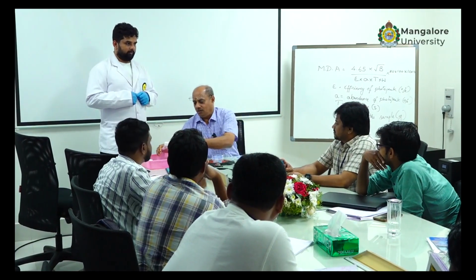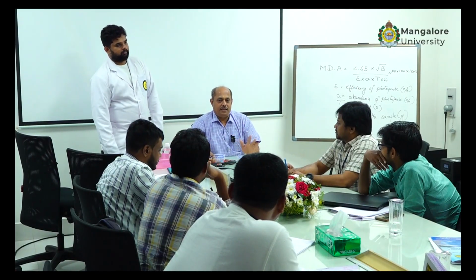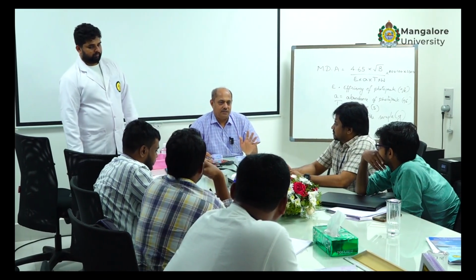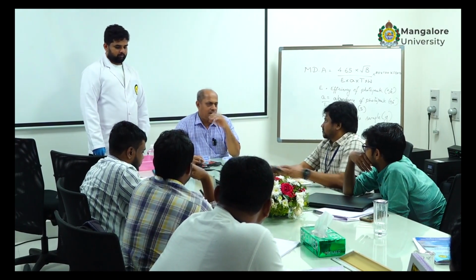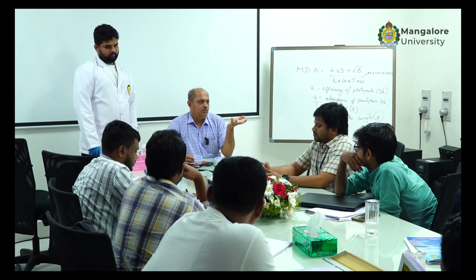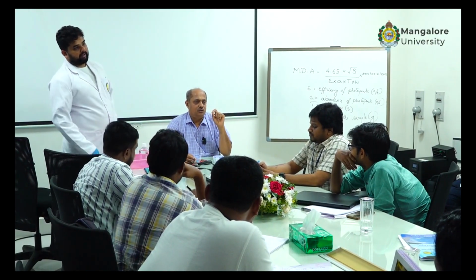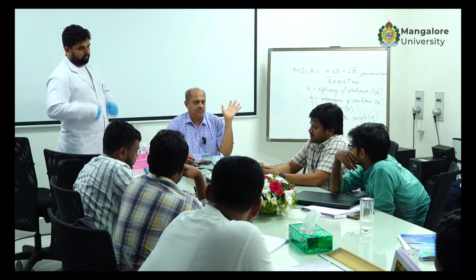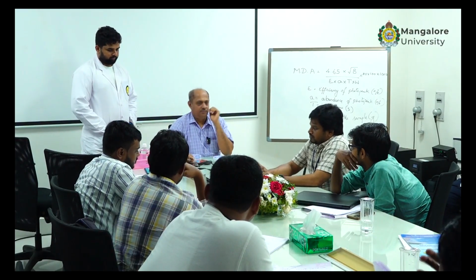So in all low background counting laboratories, utmost care has to be taken to avoid contamination. Even a drop of sample, maybe it is a background sample, still you do not know. Utmost care has to be taken to ensure that there is no spillage. Okay, that is one thing, right?